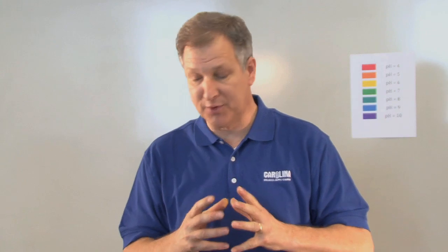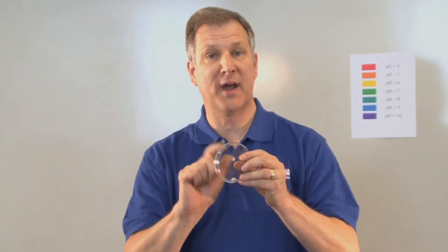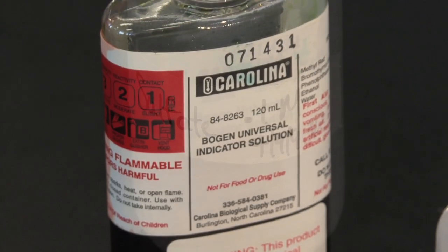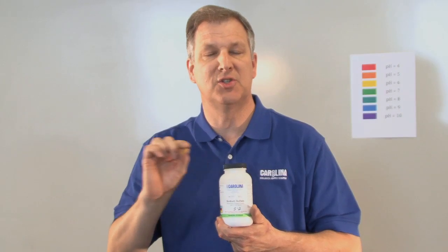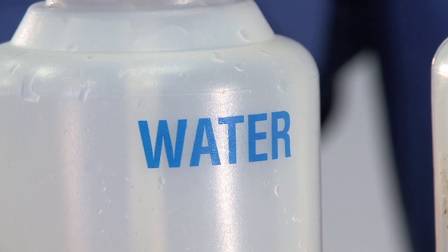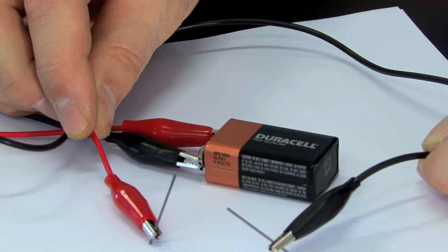Now, to do this reaction, we need a couple of different things: a petri dish — you can use a glass or plastic petri dish, it doesn't matter. We're going to use a universal indicator, a little bit of sodium sulfate that will help the ion exchange between the two electrodes — just a little bit, so there are some ions in the water, which is the third ingredient, just plain water. I used DI water and then add this to add some ions. If you want to use tap water, that's fine also.